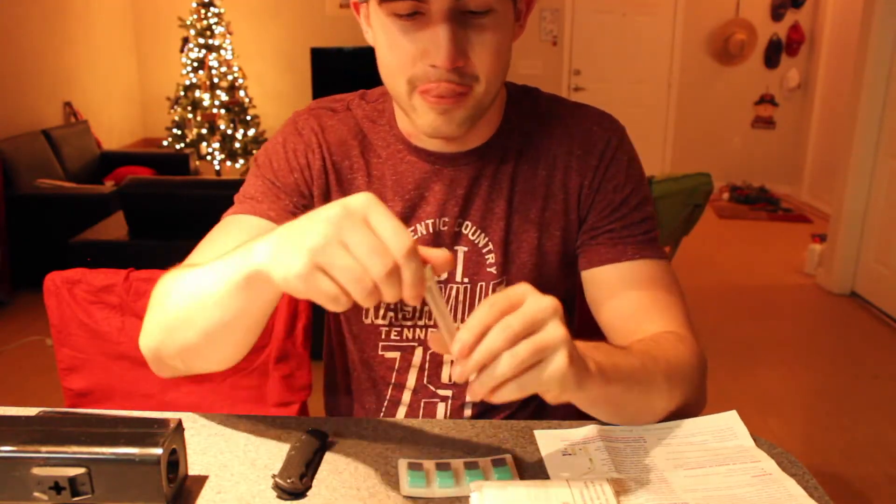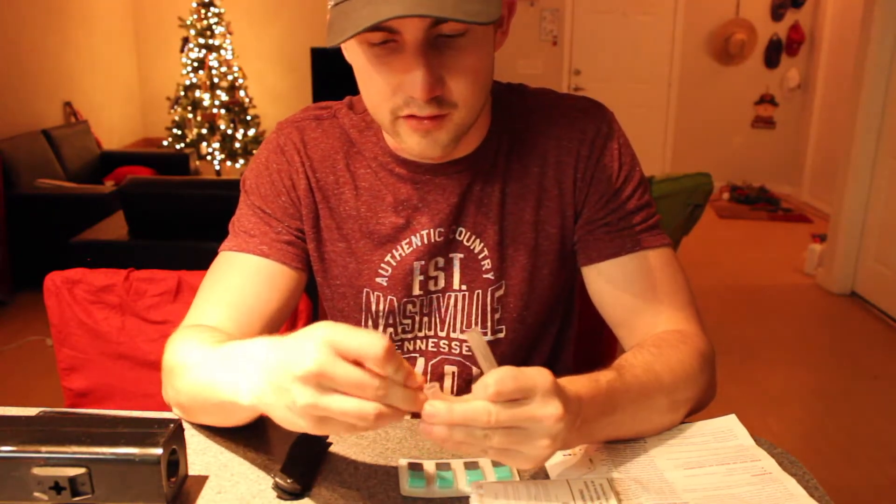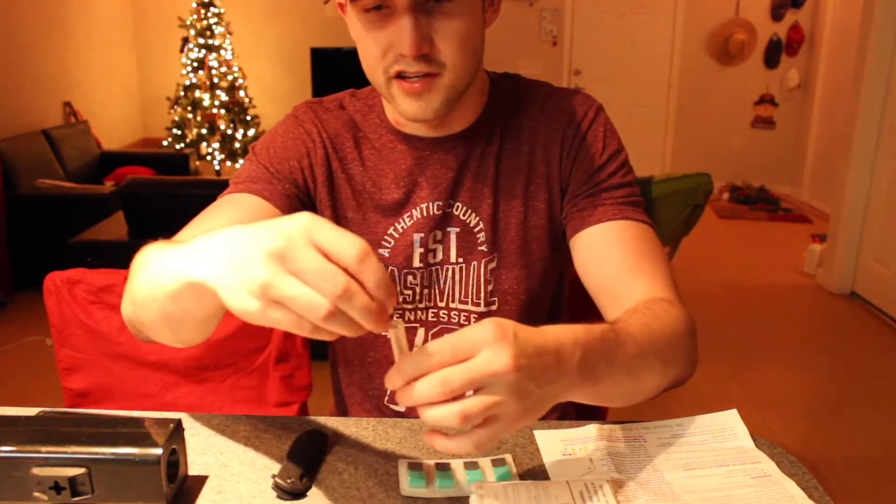I got a little metal testing kit. Open it up. It says you gotta pour the solution in first, put the cap on it and shake it until it turns green.